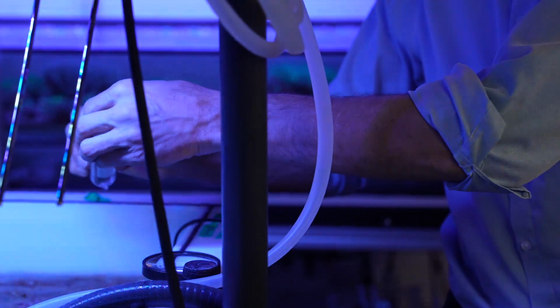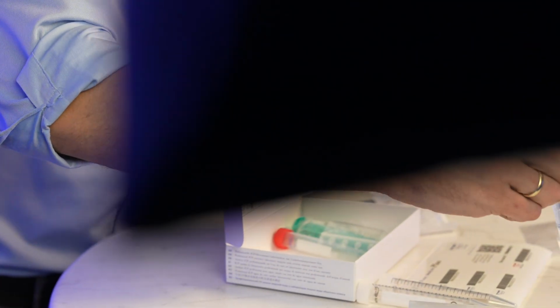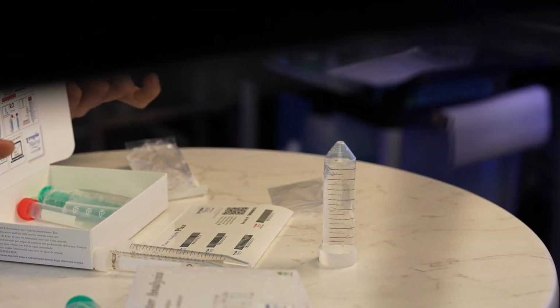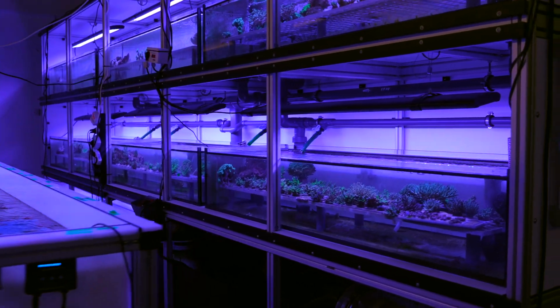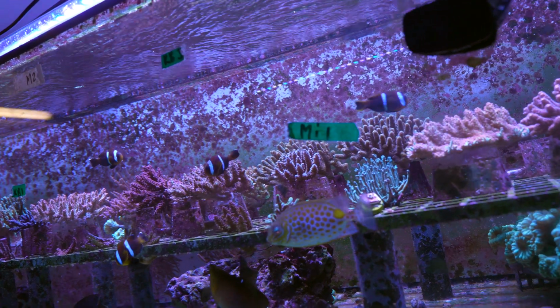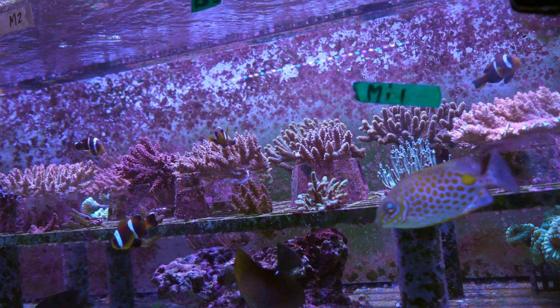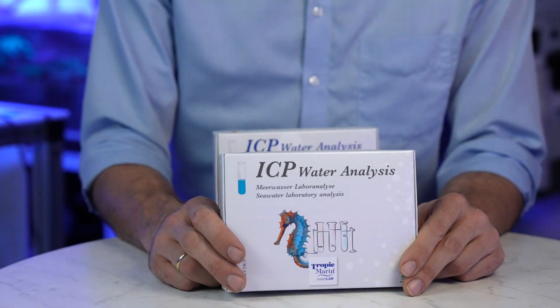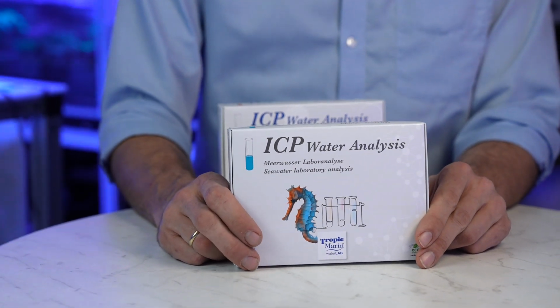One thing to consider is how often to send in ICP samples. It always depends on the circumstances, I would say. Here we usually send one ICP every week because we have a lot of systems. Basically, our livelihood depends on the well-being of the corals, so it's important to have a good understanding of what is happening and detect potential contaminations early on. Usually we alternate: one week the ICP Plus and then the normal ICP. Sometimes it's more of the normal ICP and the Plus once a month or so.